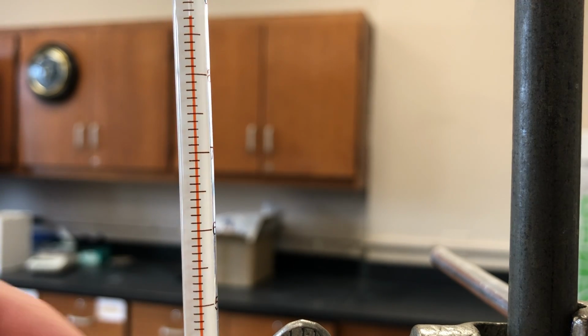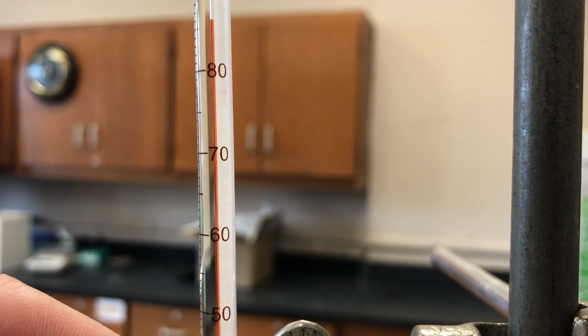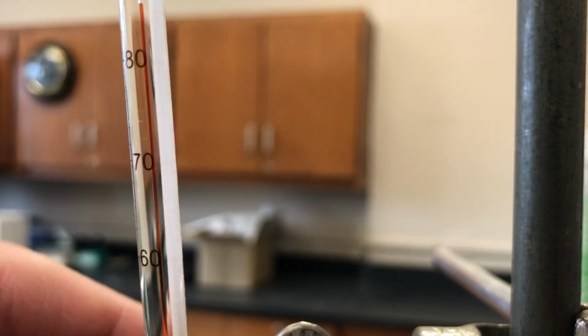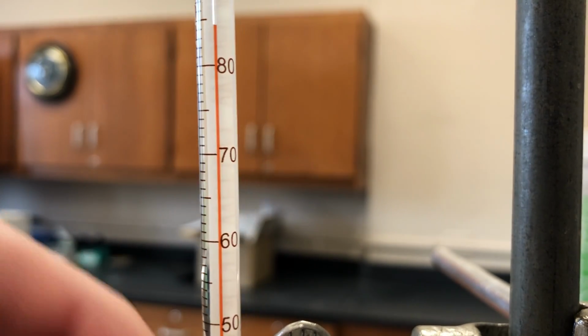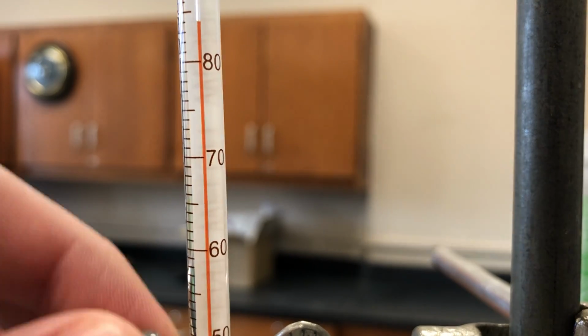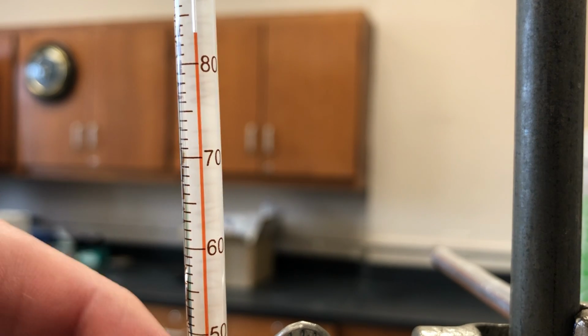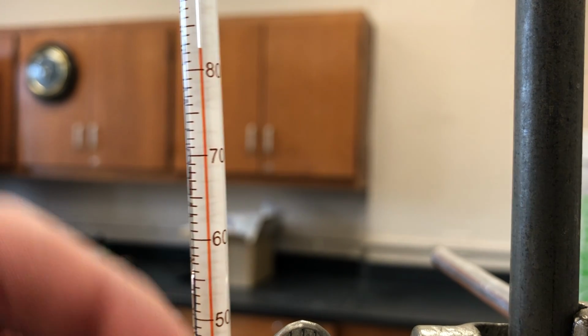So this time you get to listen to me ramble while we do this experiment. So I'm just gonna stir this and keep the thermometer turned around so you can read it. And so it's at 85, so you'll want to start your measurements now. And we're just going to keep doing this until we get 4 points that are the same.